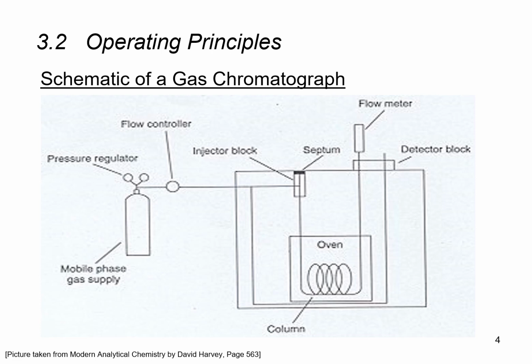Now this is a schematic of a gas chromatography instrument, and I'll briefly state the three key parts of this instrument before we'll describe this in detail later on in the chapter. So the first key part of this instrument is the gas system here.